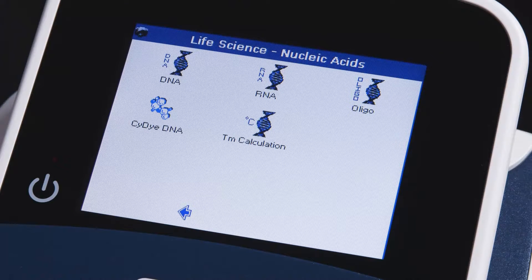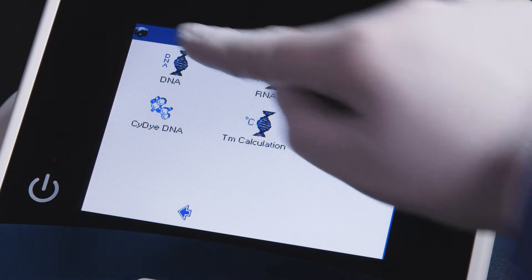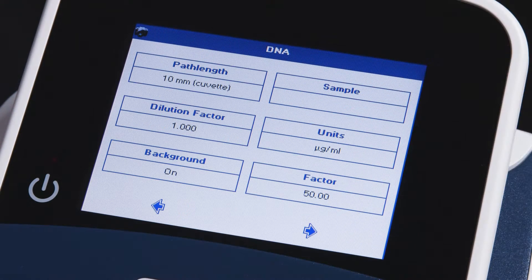You may also calculate CyDye labeling efficiency or calculate the melting temperature of your primers. In this example we'll be measuring DNA concentration.